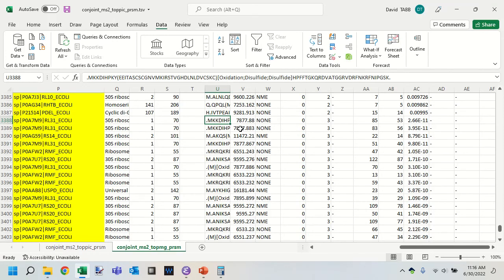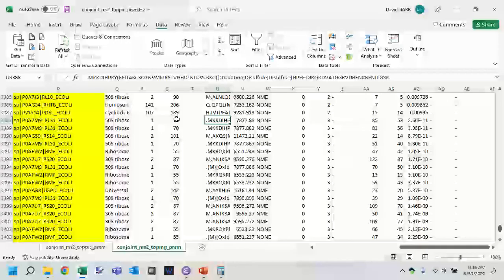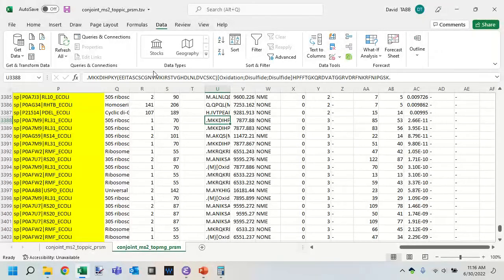So does that match up? 1 cysteine, 2 cysteines, 3 cysteines, 4 cysteines, and 1 methionine. I think that in this case, it is plausible that yes, there are 2 internal disulfides and an oxidation that all fall within this region. But we see that the software is going to require us to do the detective work of which one is most plausible as we interpret it.